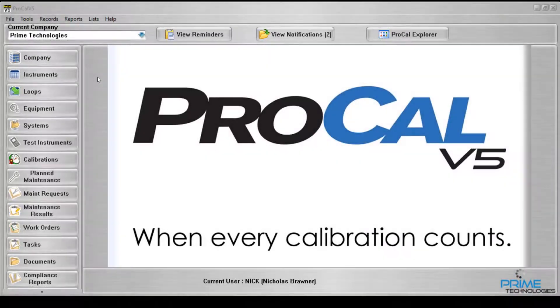In this video I will be discussing the pipette test type package. The pipette test type package is designed to record pipette calibration data.